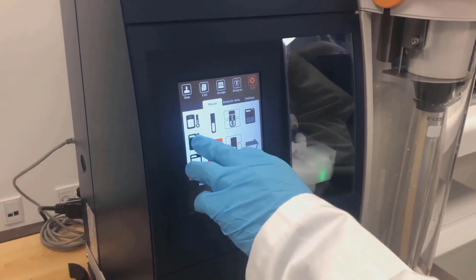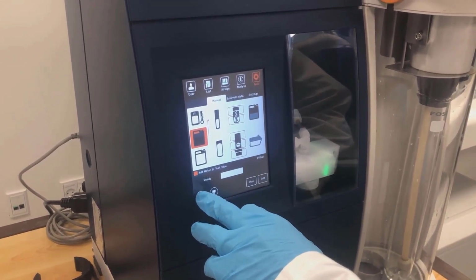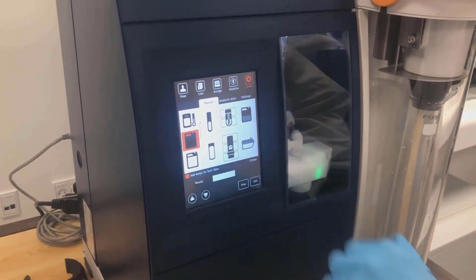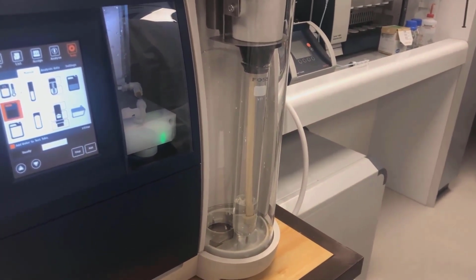Now this is the first step. We will add water to the digestion tube. We will choose 150 milliliter. You can control it by pressing a button. Then you add, so there will be water dosed in the digestion tube.